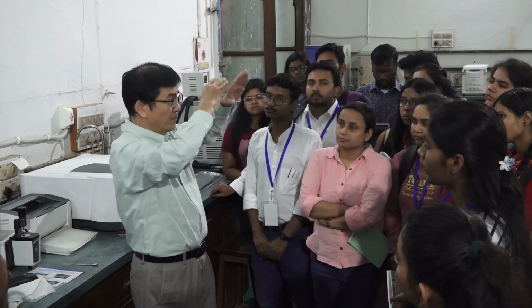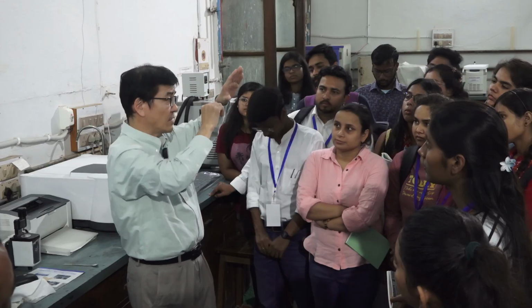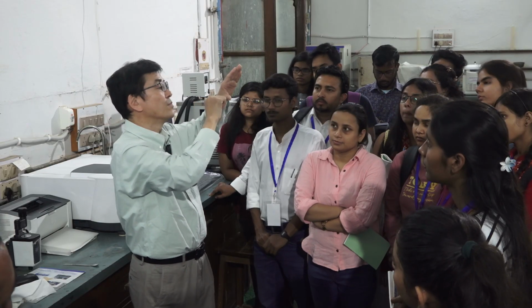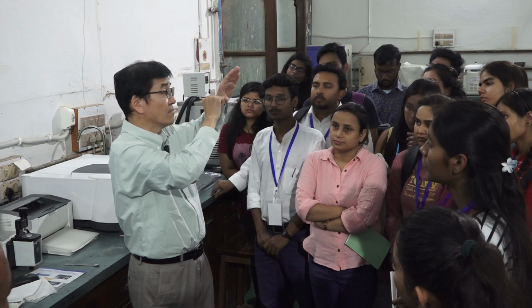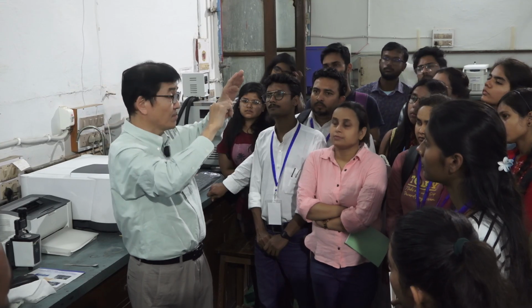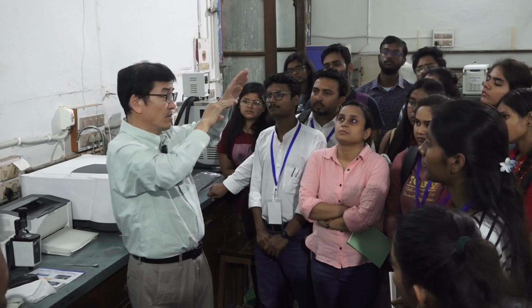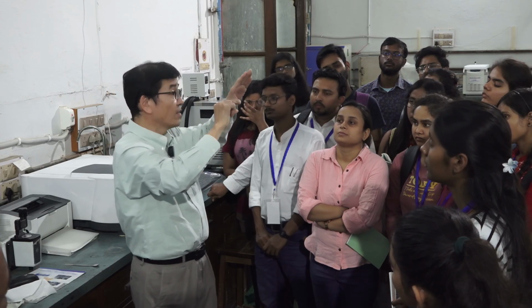And this total reflection generates a weak but stable IR light. This is an evanescent field. So the IR beam is on the surface of the prism.